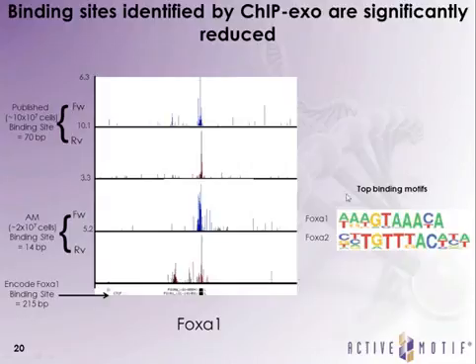Now, many of you watching this are probably saying, well, that's all well and good that you can get such data using CTCF and FOXA1, but those transcription factor binding sites are some of the most ubiquitous binding sites throughout the genome. What really happens when you look at a less pronounced transcription factor binding site? And we had that exact same question.